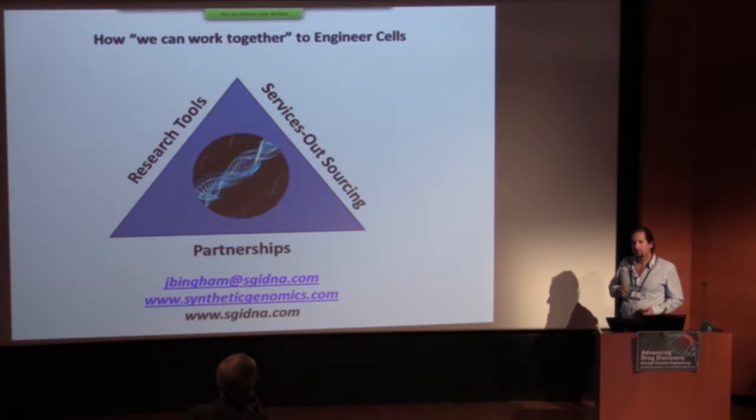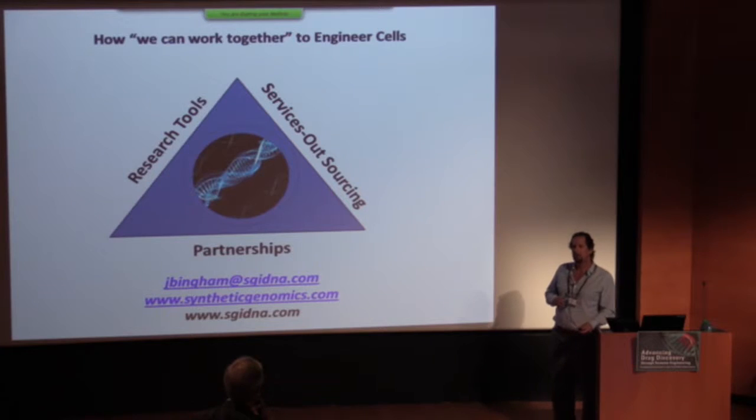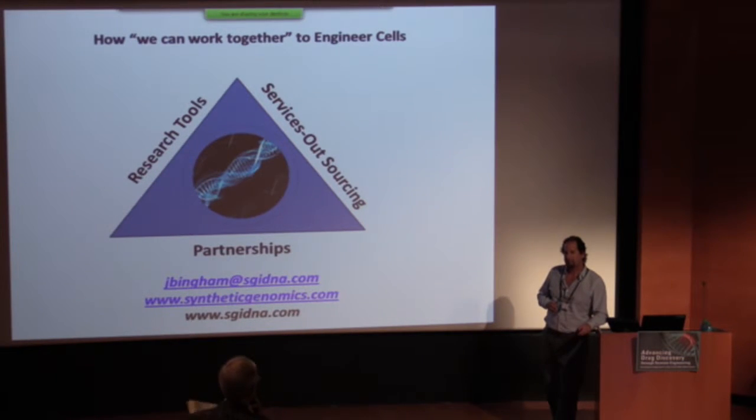Does your DNA synthesis technology permit you to synthesize any DNA sequence? Because in the past, sometimes I would order some sequence and I was told, oh, it's too complex, we can't approve it. Yeah, we'll still say that.